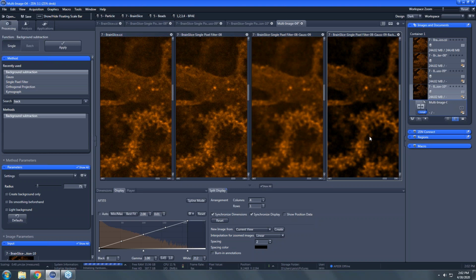So the interpolation is exactly like what happens in Adobe Photoshop, for example. If you acquire a 512 by 512 image and you want to put it on a poster as the largest figure, and you blow it up to 2000 pixels by 2000 pixels without any adjustment, you will see quite a bit of pixelation. If you throw it into Photoshop and say, I want to make this 2000 by 2000, Photoshop will interpolate the pixels, and you'll get a smoother image. So you won't see the pixelation.